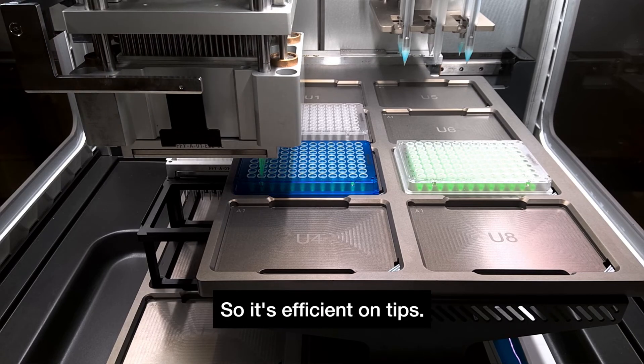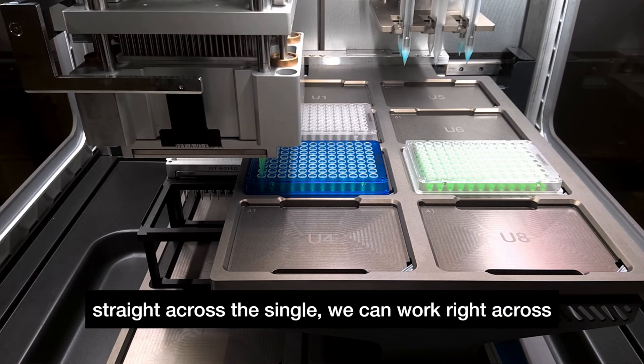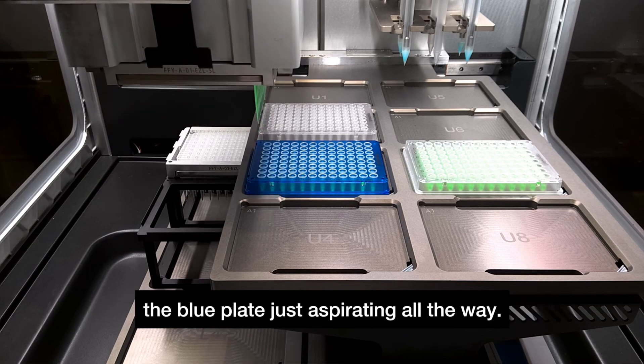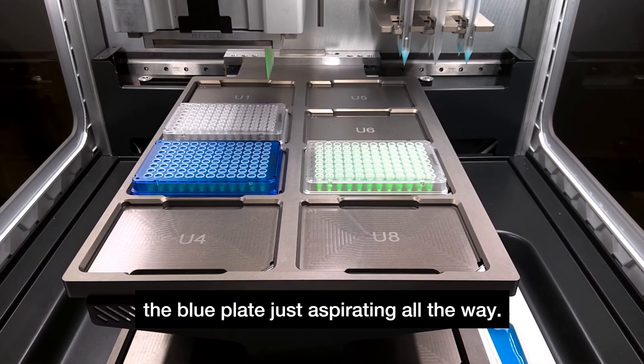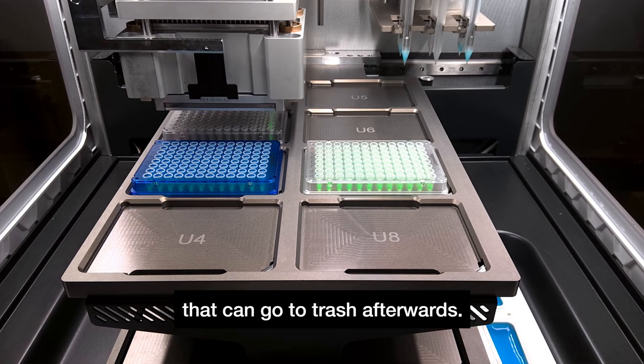So it's efficient on tips and very fast because we can work straight across the blue plate just aspirating all the way and we're not worried about cross contaminating it because that's just a working plate that can go to trash afterwards.